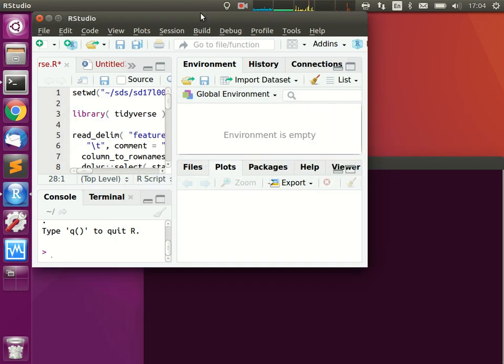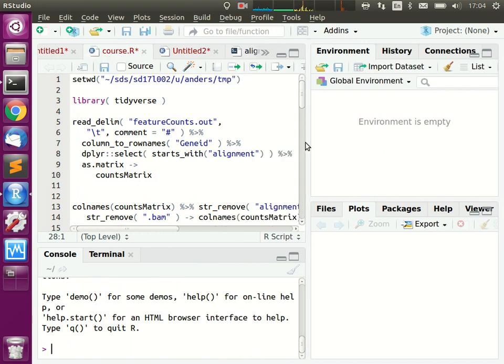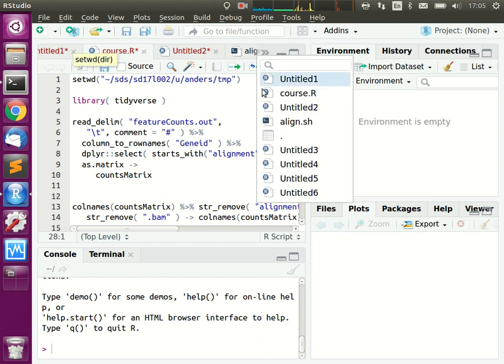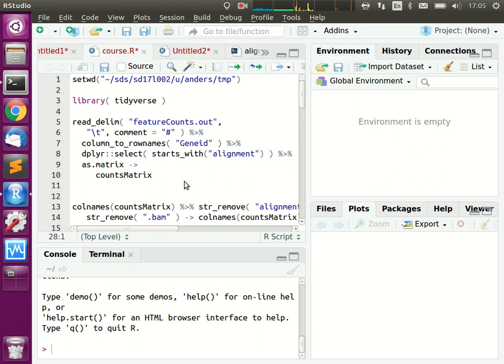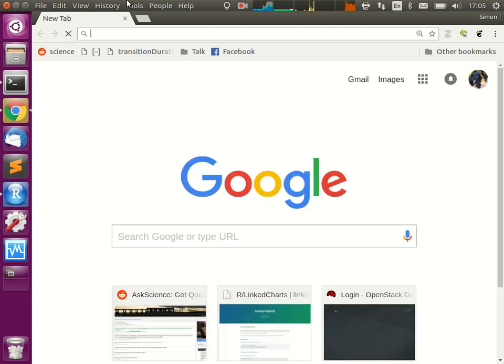What we did was that we worked a bit on RNA-seq data, and we used this example file from, do I still have this here? Just a second. Computer crashes are annoying. So we used this example data from this airway smooth muscle cell data set.